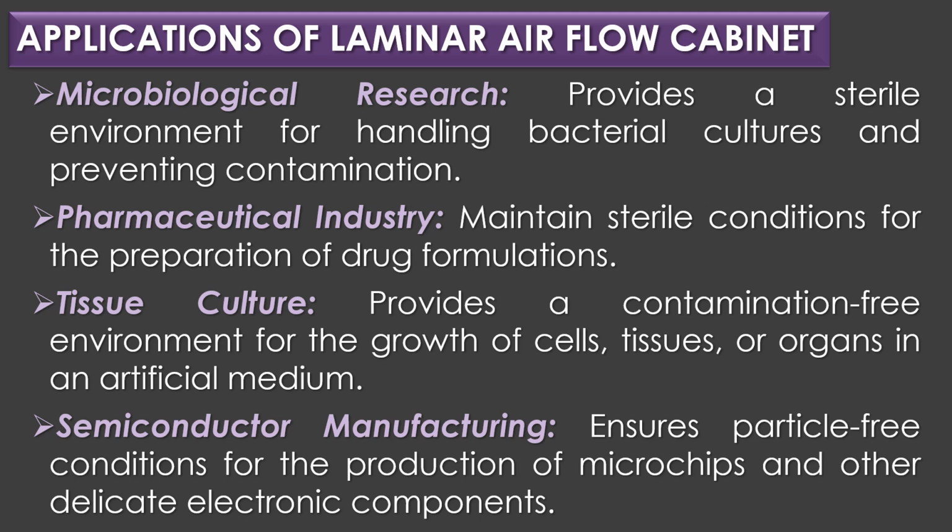In tissue culture, laminar airflow cabinet provides a contamination-free environment for the growth of cells, tissues, or organs in an artificial medium. In semiconductor manufacturing, laminar airflow cabinet ensures particle-free condition for the production of microchips and other delicate electronic components.